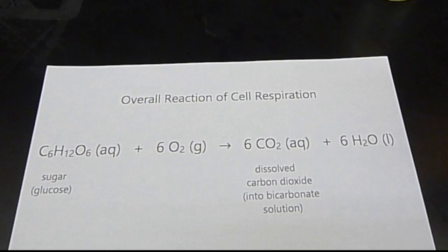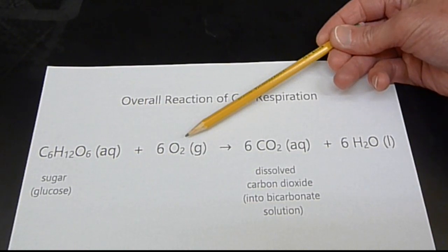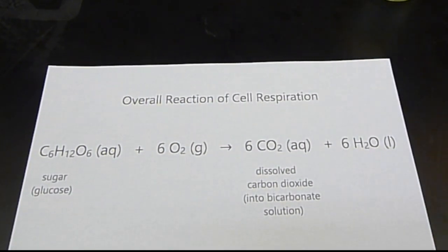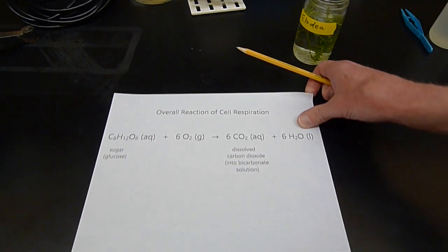And when it's in the dark, no photosynthesis is occurring, but it will be consuming oxygen. And as it consumes oxygen, then we can measure how much oxygen really will be consumed. We'll be able to watch that change in the volume, in the volumeter, as it's called too. And then we combine those two things to get the net production of oxygen by photosynthesis.